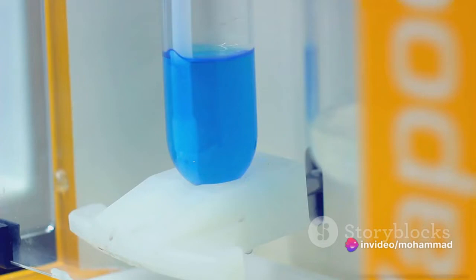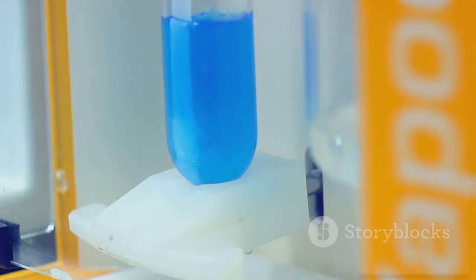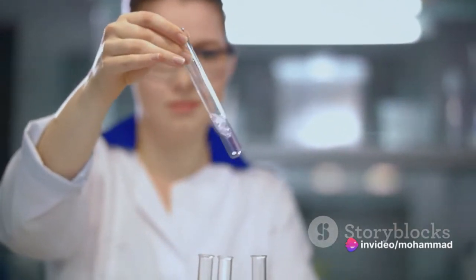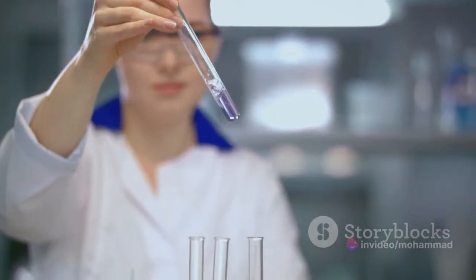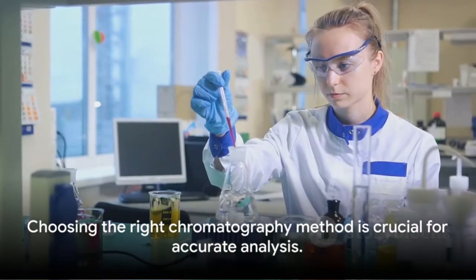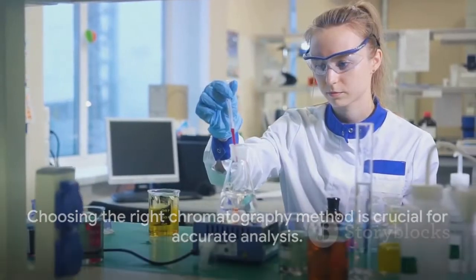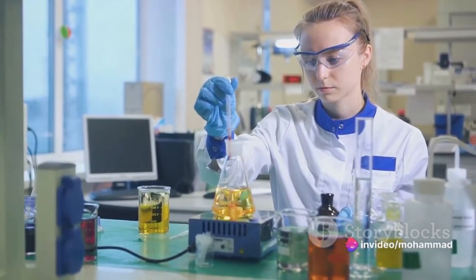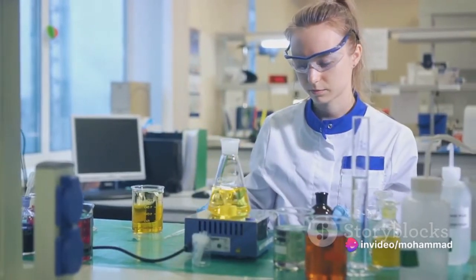On the other hand, in gas-solid chromatography, the stationary phase is a solid. This type of chromatography is particularly useful when dealing with gases and small polar molecules. The solid phase can selectively adsorb these molecules, providing us with detailed insights into the composition of the sample. So whether you're using GLC or GSC, the choice ultimately depends on the nature of the samples being analyzed. It's all about finding the right tool for the job.